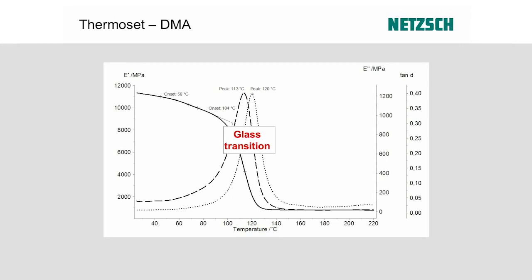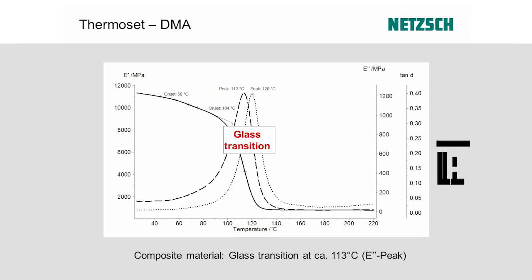So what is that? That's the glass transition of my thermoset. So this is what determines the application range, because I would not necessarily build an aeroplane that has to stand higher temperatures with that kind of thermoset, that you can easily tell from this graph. So we know the glass transition, but I said there's more, because now we can do thermal analysis. So we just take the same sample and we just heat it once more.